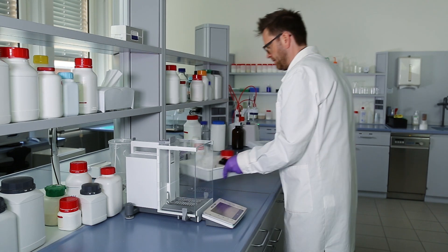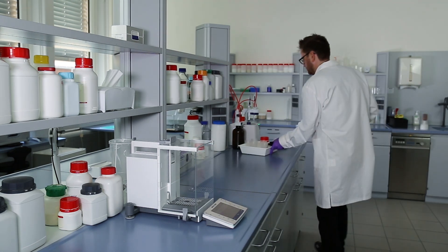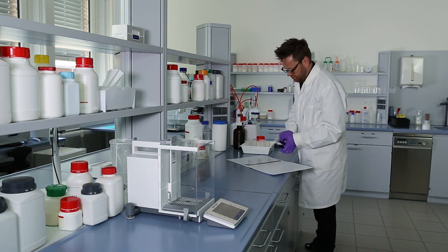Once the five titration beakers are ready, the technician moves to the titrator for the next batching process.